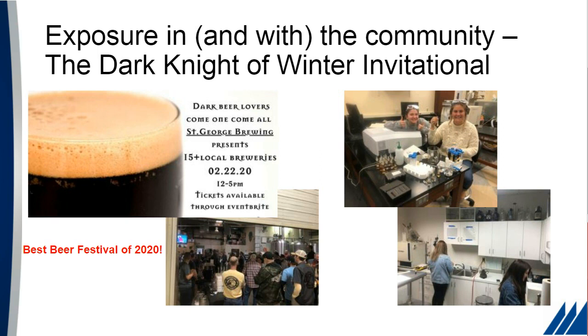And Sam and Ashley actually ran almost 40 samples of dark beers, using the centrifuge, filtration, and dilution, all to make the ASBC color measurements within a few hours. And then the picture below the invitational, next to the tag of the best beer festival, was a presentation. The darkest beer was presented to Twisted Knot Brewing, which is in Newport News, another local brewery. It was a lot of fun. We were interacting with the community, out there showing what we could do, and there was a scientific aspect to the award of the darkest beer.